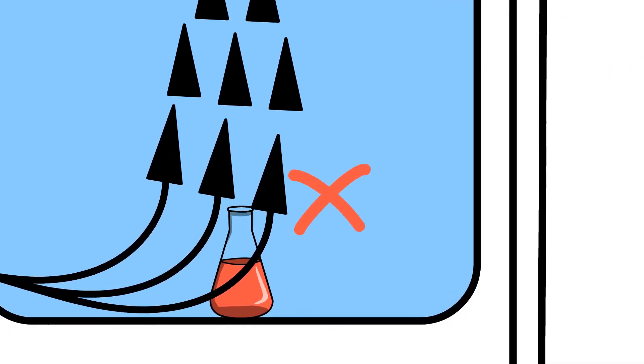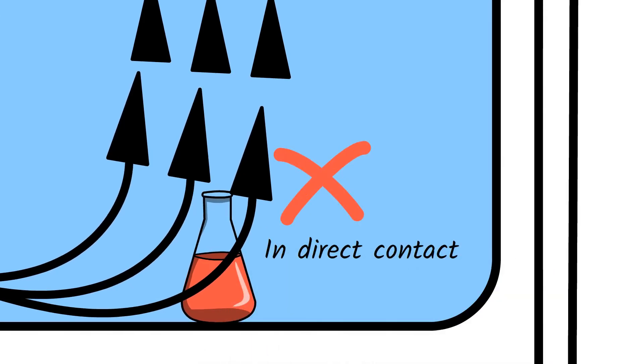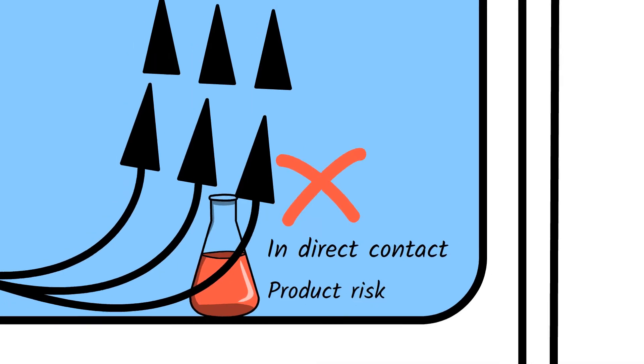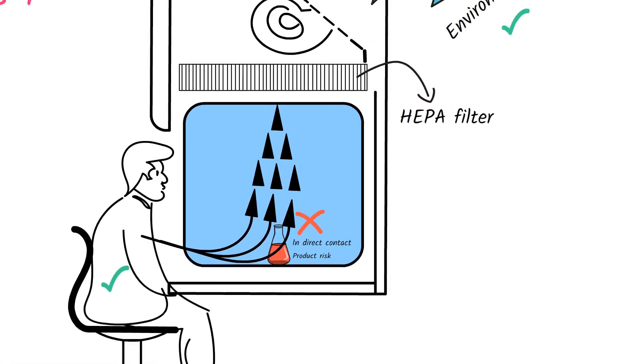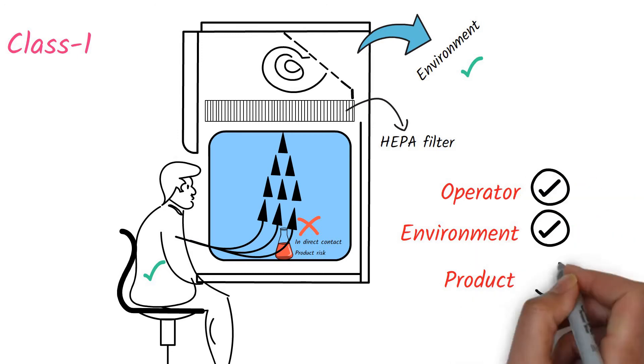In this case, the surrounding air is coming in direct contact with the product on the work surface and therefore increasing the risk of product contamination. In this way, the Class 1 biosafety cabinets protect the operator and the environment, but not the product.